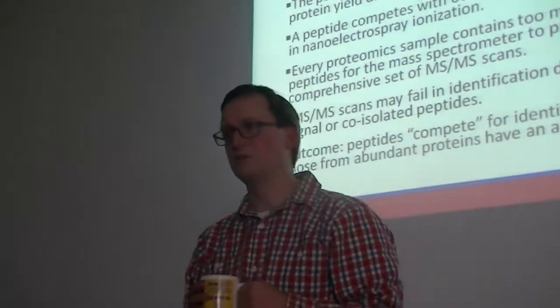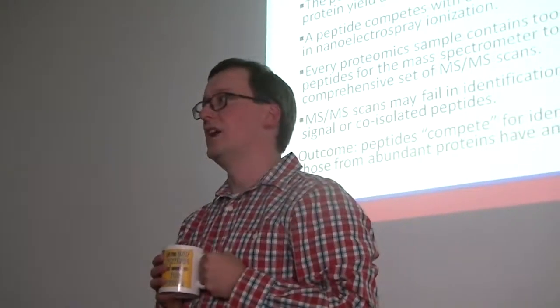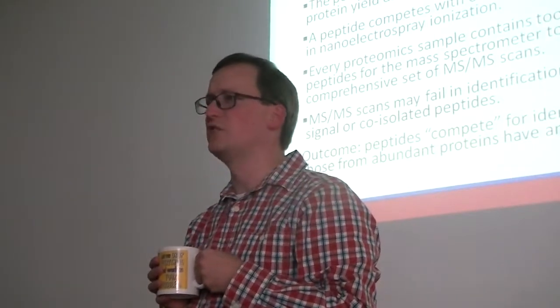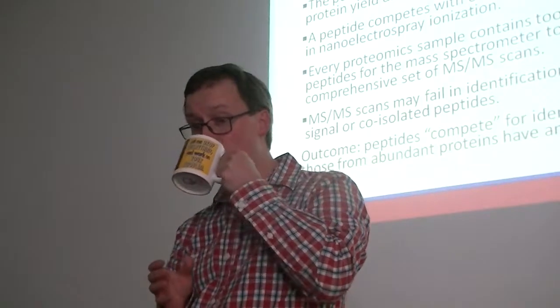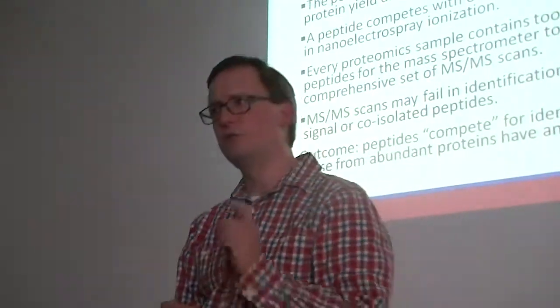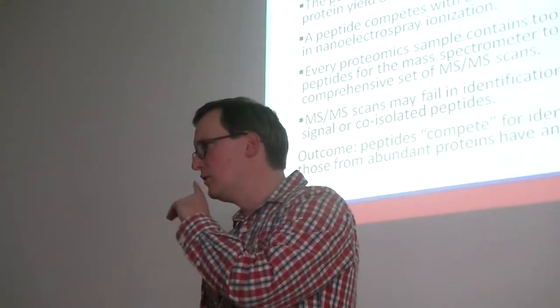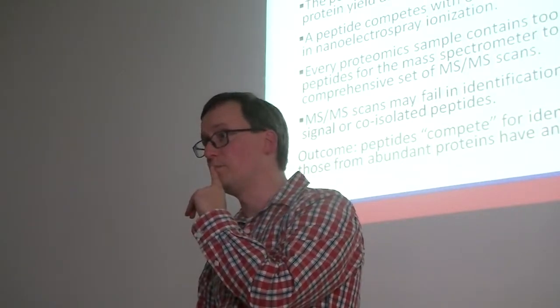So I'm going to introduce the topic of spectral counting. Spectral counting is a semi-quantitative method that we largely use to determine which proteins are changing between a couple cohorts. As I think you remember from yesterday morning's practical, the evidence that we see for a particular protein will usually span multiple peptides that map to that protein.